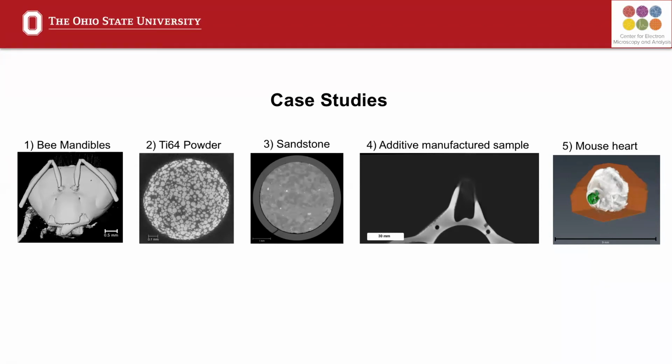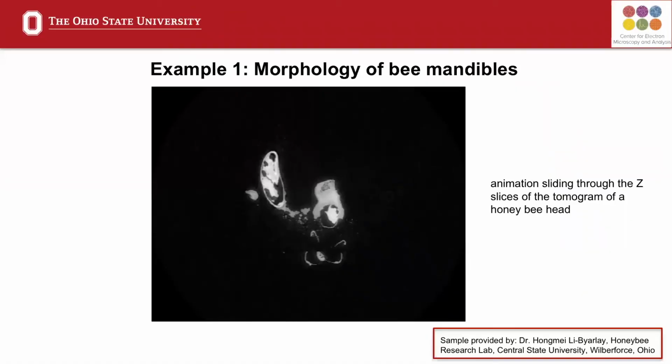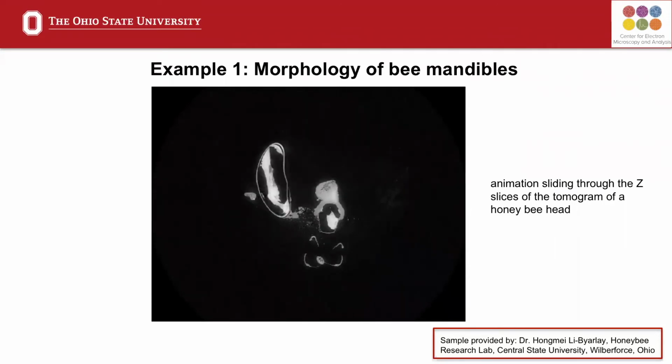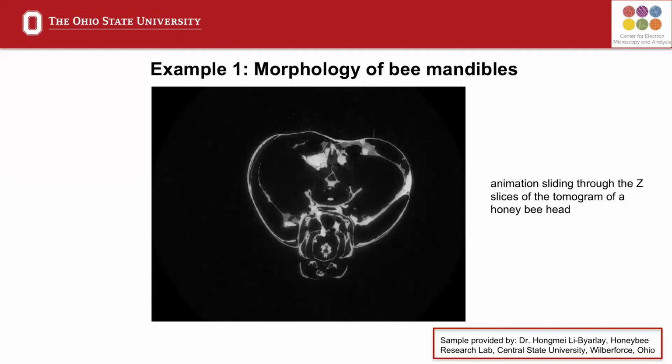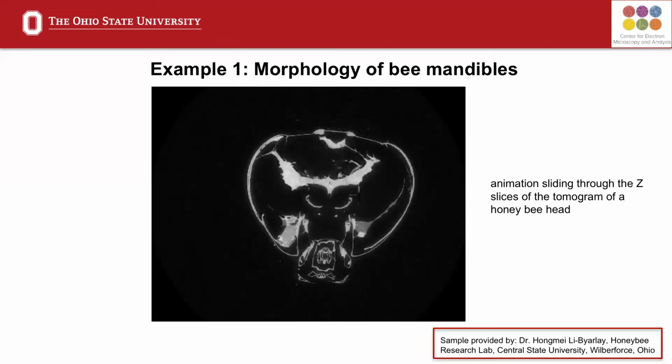So we're going to start with talking about the honeybee. While I have it on the screen here as a volume rendering, I just want to point out where the mandibles are on the head. This feature here, I'm hoping you can see my mouse, is one of the mandibles. And then just behind it is the second one. These use their mandibles a bit like we use our teeth or hands, for tasks involving biting, picking up and moving items, and physically breaking down surfaces.